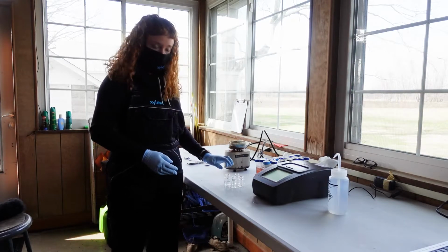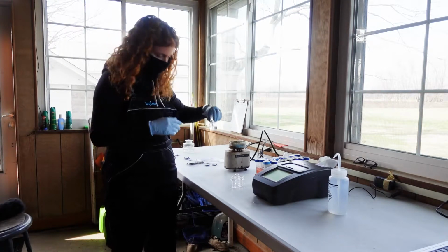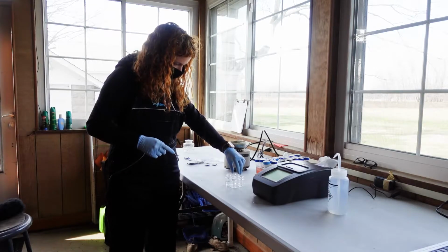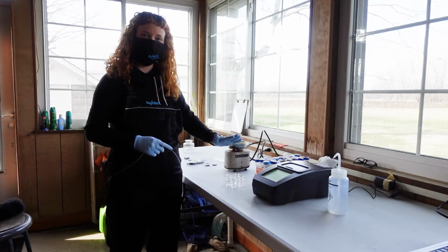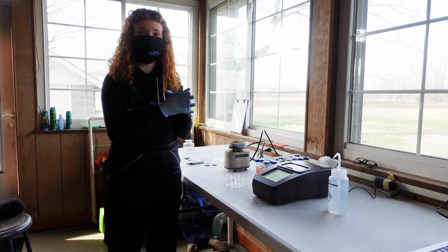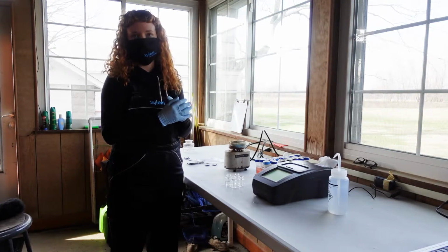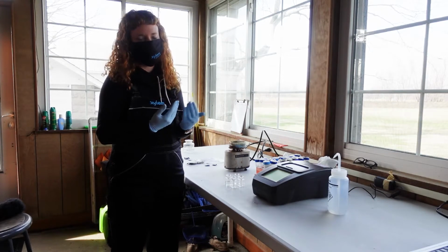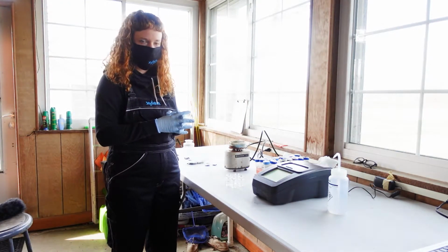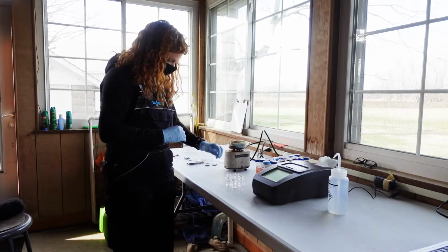Something interesting that you will note about them is that they have numbers on the top. 628, that's what this one says. And I have another that says 628. What this means is that these two cuvettes are optically matched. So when I have two that have the same number, I can use those throughout the process together. If we have two different numbers, it means there could be some slight variations in the cuvettes. It could cause some slight variations in readings, which may impact our calibration and our QA/QC. So whenever you can, use those two matched cuvettes.